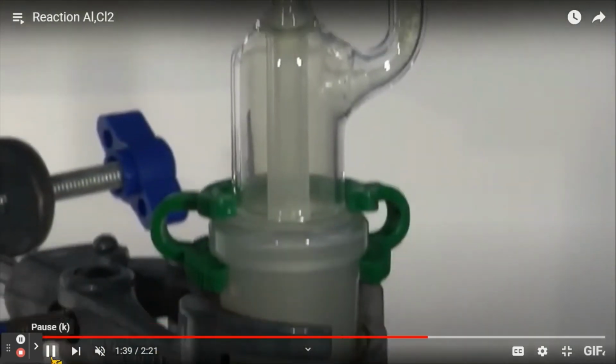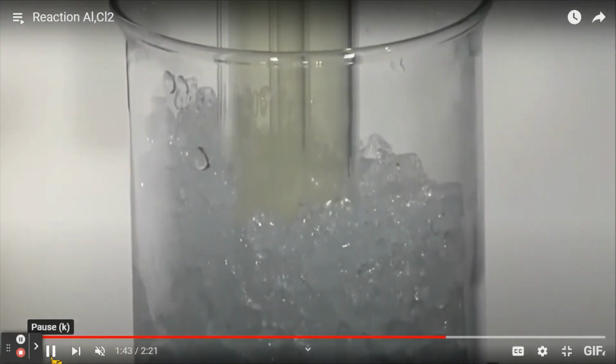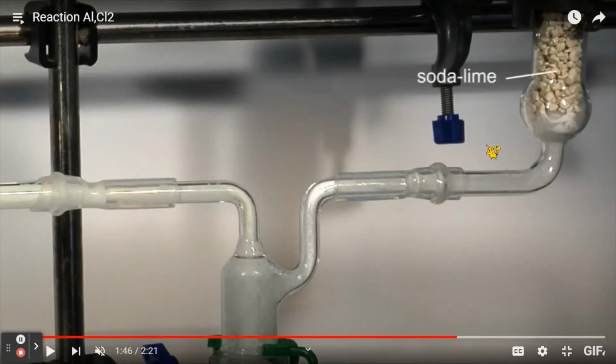So this volatile substance, you can actually see that this is after that glass tube, and what they have done is they've used soda lime to keep everything completely dry so that the aluminium chloride does not react at all. So this would be the outlet for the chlorine.